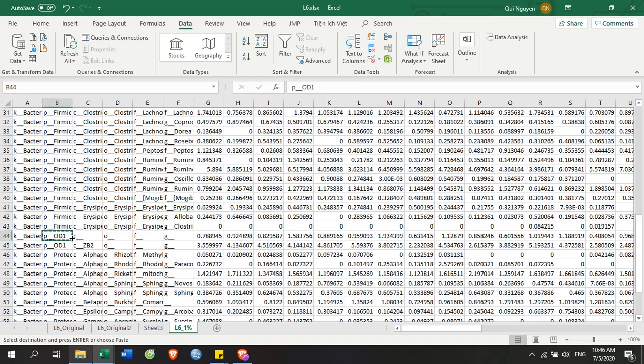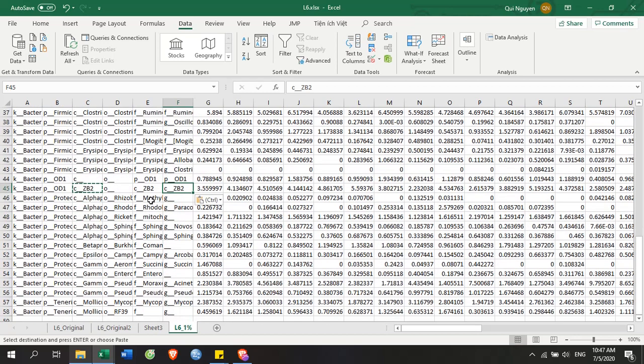Wow, fine. Family, genus. I don't get this information, so I don't need it. So this, up to phylum level, is not identified. I can see in some papers they characterize at genus level, but some they cannot. So they can only detect at the phylum level. In that case, they also say unclassified, like Proteobacteria something.